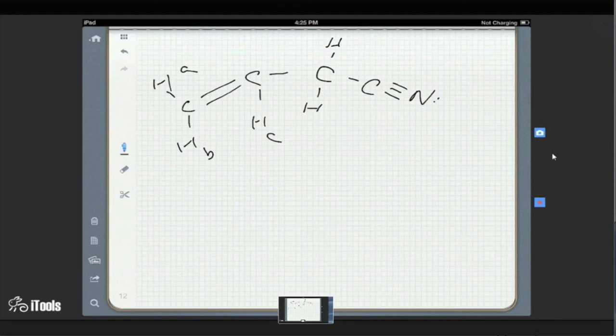How do you know that the alkene is here rather than somewhere else? Because that's the only way to get 3 different alkene H's between 4.5 and 6. If you made the alkene between 2 things, you'd only get 2 H's. And we don't have any methyl groups. So to get the 2 H's at 3 is the struggle right now.